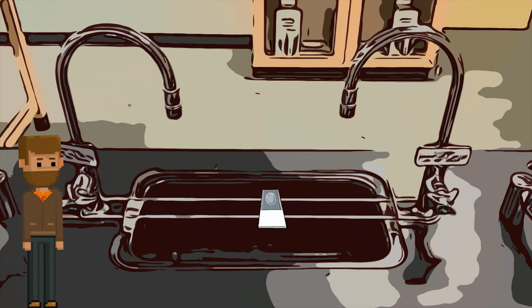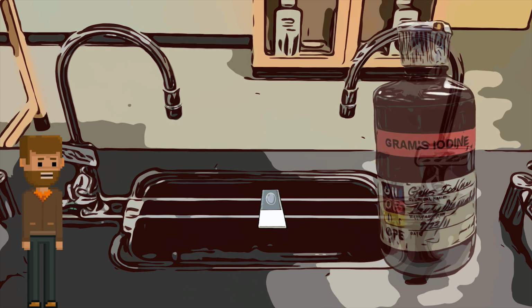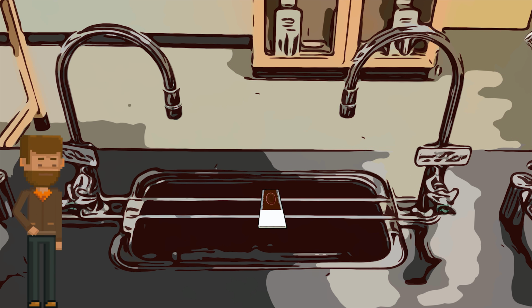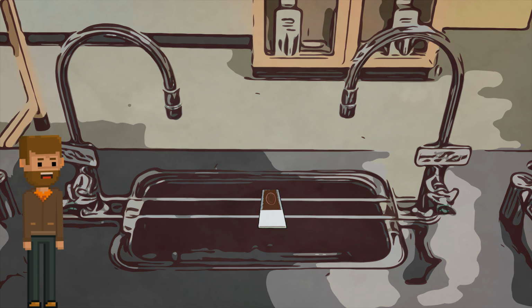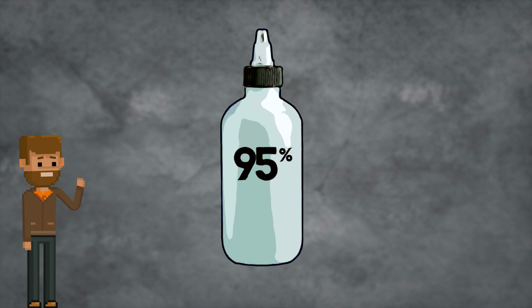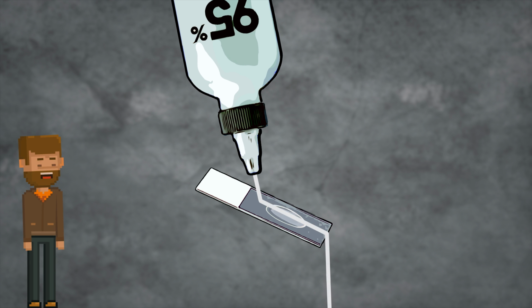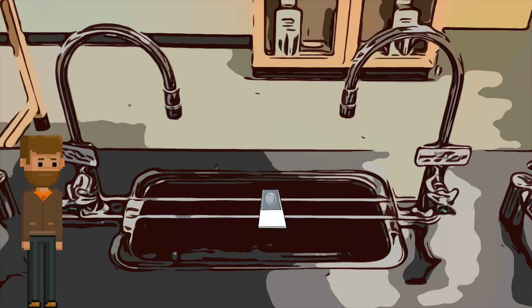Next, you're going to place the slide on the staining rack again, but this time you're going to stain it with Gram's iodine. Let this react for 30 seconds to a minute. Once the time is up, rinsing is optional, but you will have to decolorize. Decolorization is a very critical step in gram staining, and you'll have to use 95% alcohol to do this. So holding the slide over the sink with a clothespin, carefully decolorize it by quickly flushing the smear with the 95% alcohol.